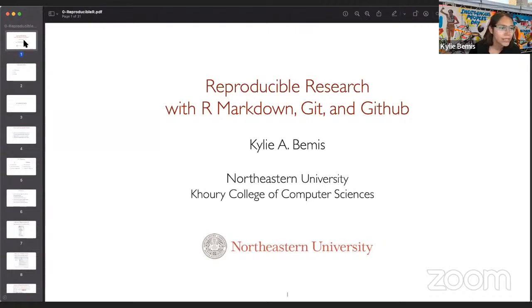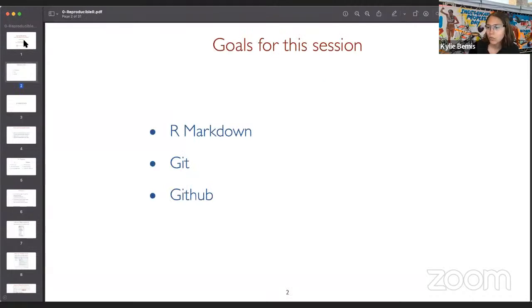So I just want to quickly touch on some of the tools that we have for making sure that our work is reproducible, and some of these tools are also important when it comes to collaboration and developing R packages and working with R developers.